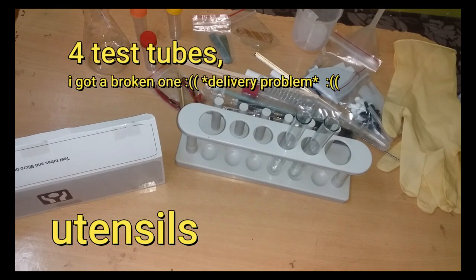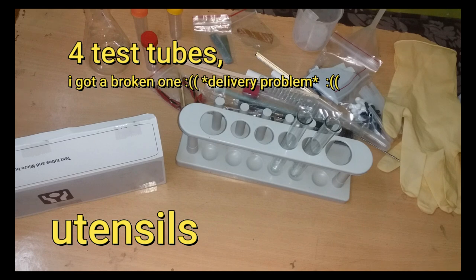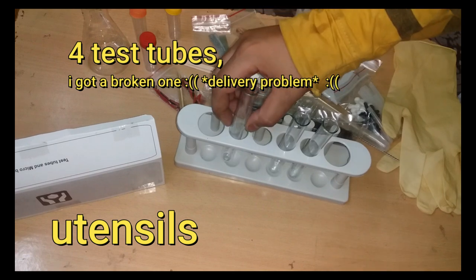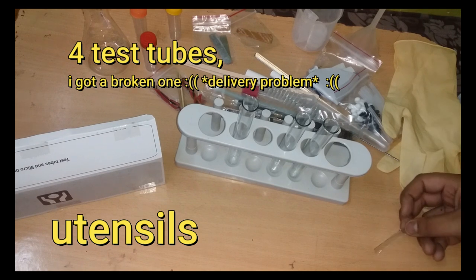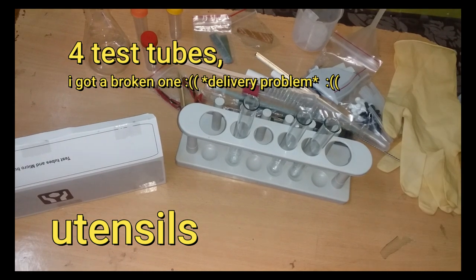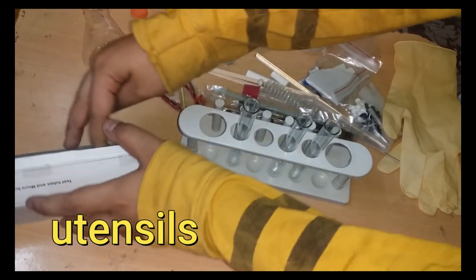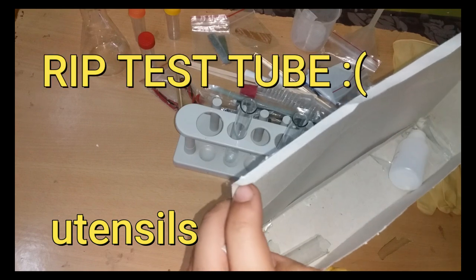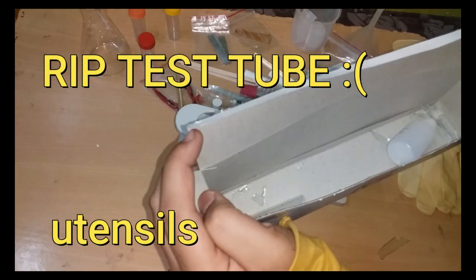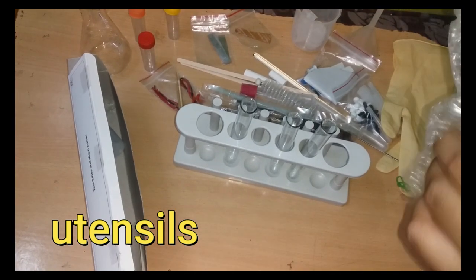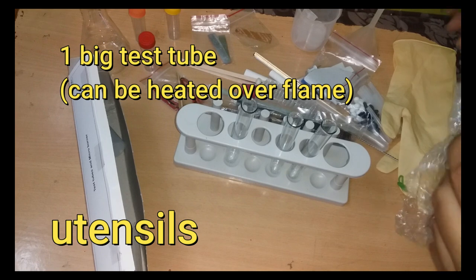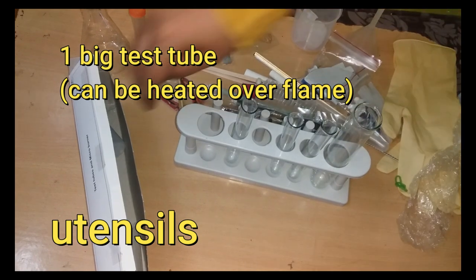Utensils for test tubes. I got the broken one - really big problem. You know, I think it crashed somewhere there, but okay. I think I should have more gloves. Okay, so this is rip test tube, rest in peace 2021. And we also get the bigger test tube which you can heat over flame. The other ones are not supposed to be heated over flames.